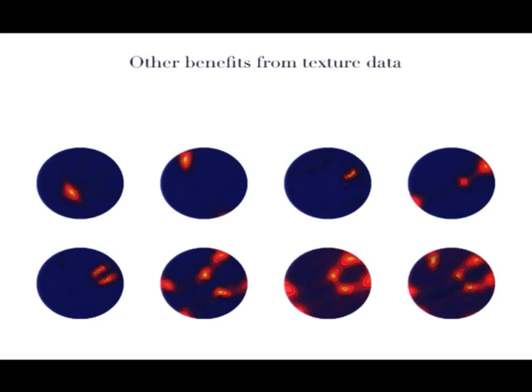They would plot the angles measured from a crystal on a stereographic projection and then find out what the symmetry is of the crystal.